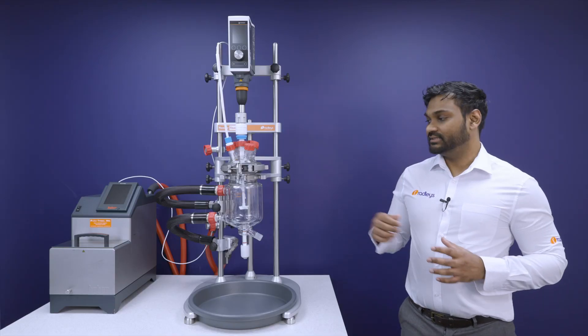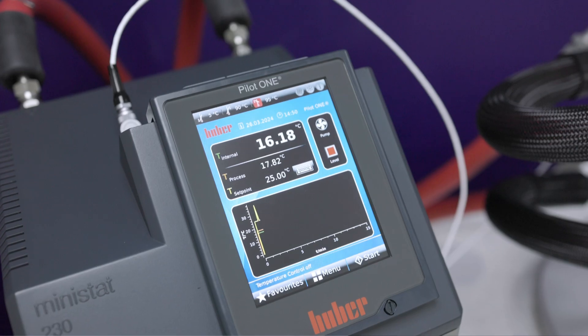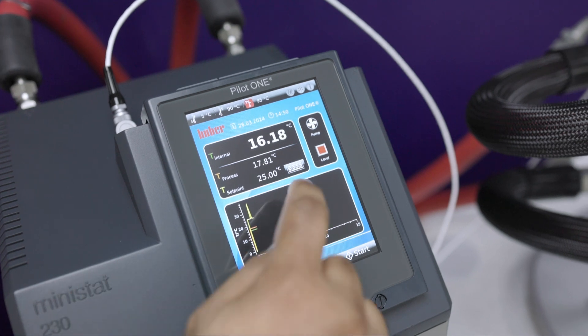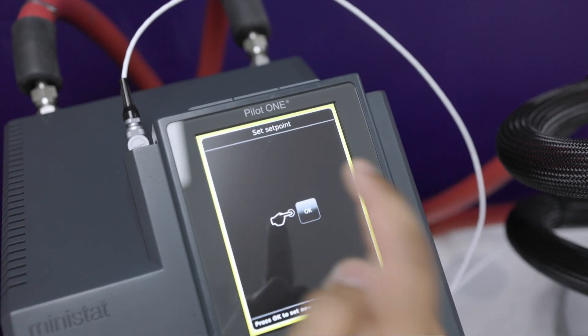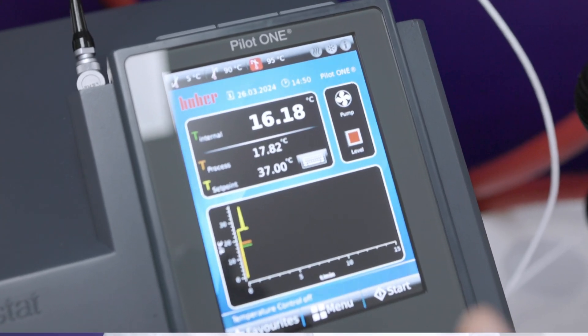A temperature probe in your reactor connects to your circulator, which allows you to digitally modulate the temperature of your thermal fluid in order to keep your reaction contents at your set point — whether that's plus 37, minus 60, or plus 160 degrees Celsius.